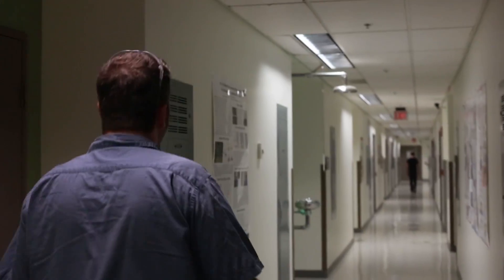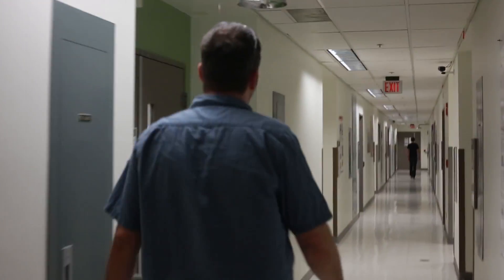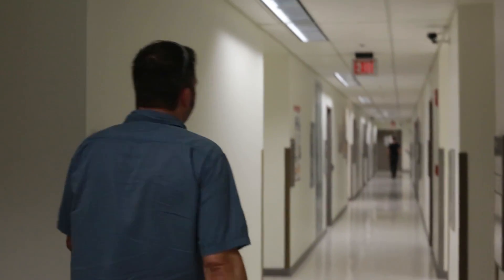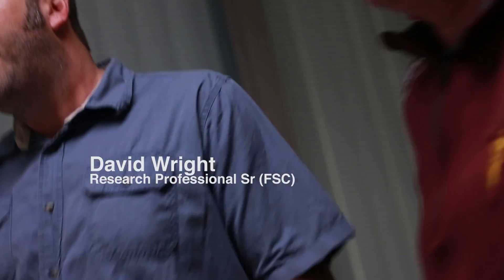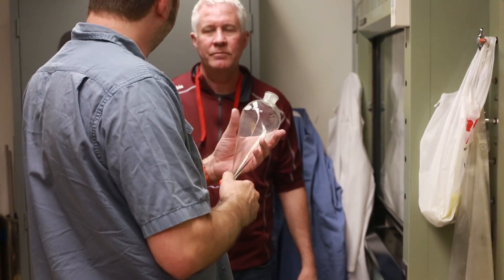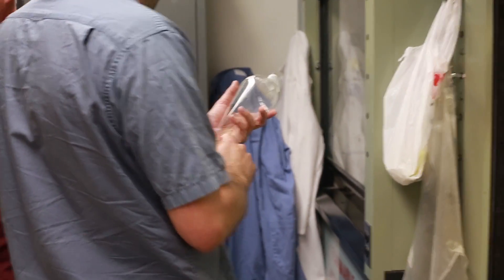I-Beam. We're getting permission for hood usage for mercury filtration. Is that him? Yep, that's him. Hey, I was just looking for you. I'd like to use one of your hoods. That should be fine. You have everything you need to get in here? This is the place. Yeah, this is home.